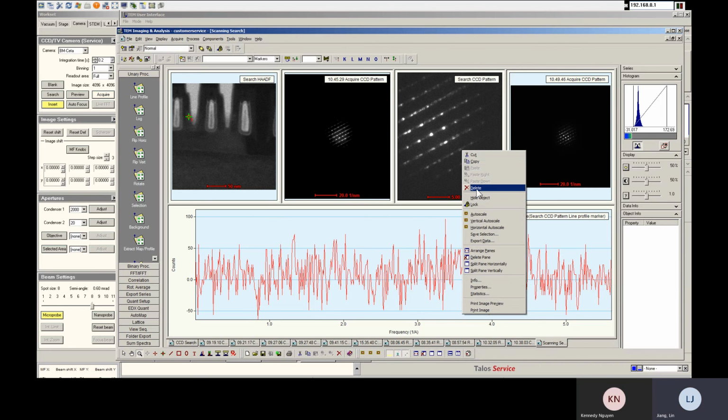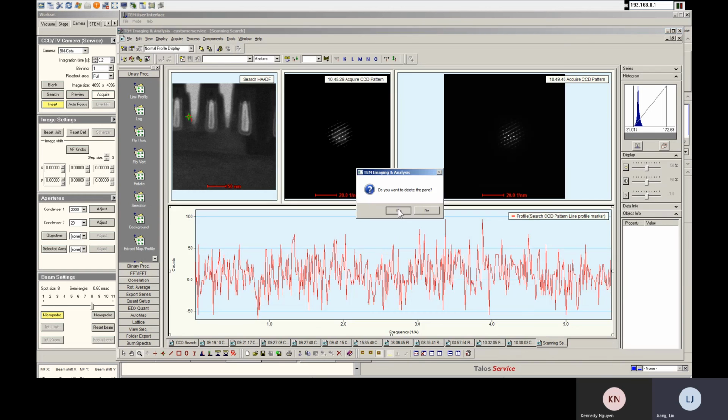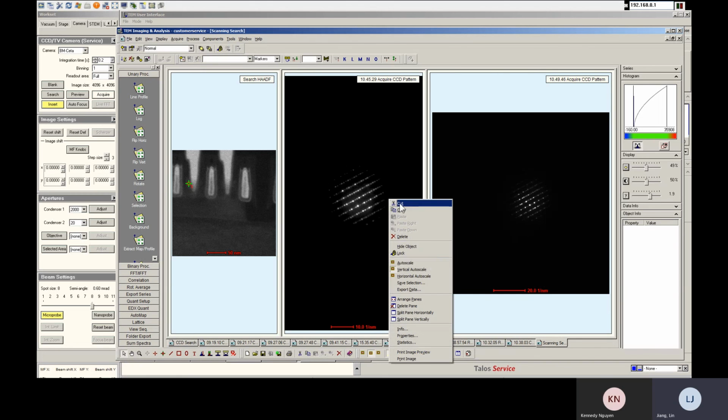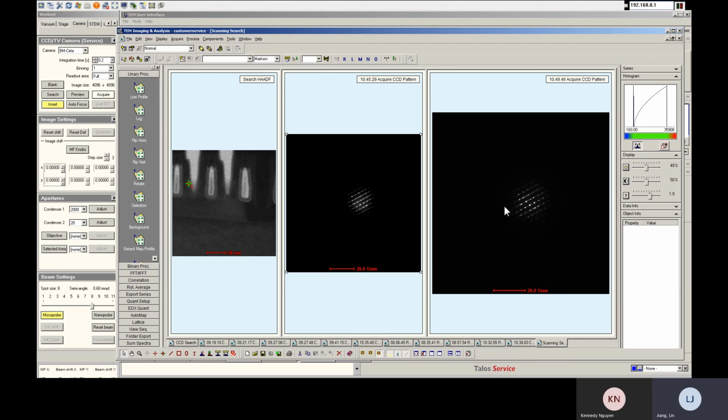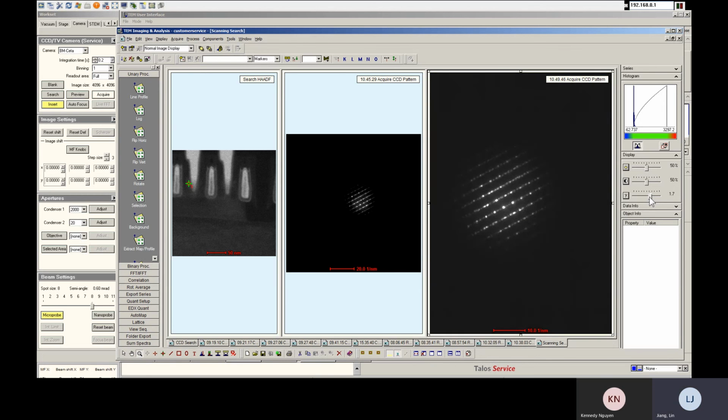Okay. Delete this. So this is your 4K by 4K image.